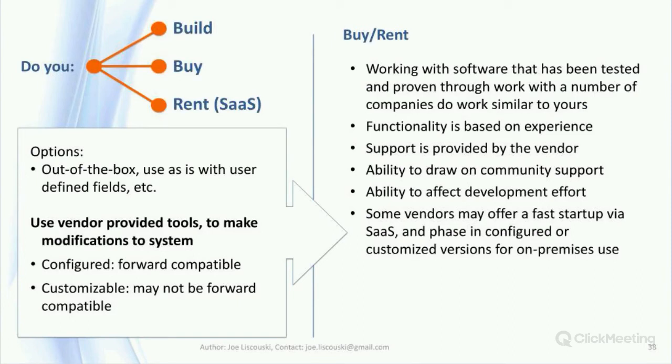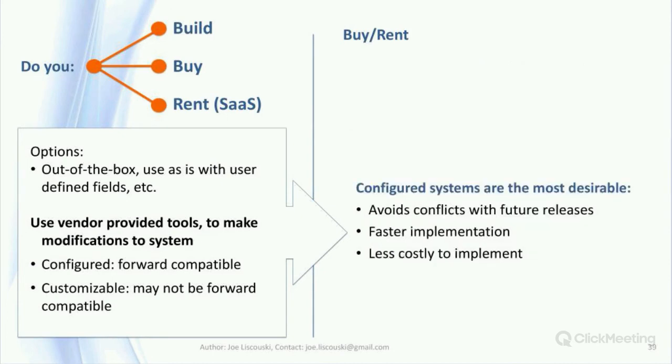How fast you can put the software into practice depends entirely on the preparation you've done in understanding the technology, how it relates to your lab's work, the development of user requirements, and keeping your lab apprised of available products. If you haven't done any of that, you're looking at potentially a year or two's effort. If that work has been done, you should be able to get up and running quickly, particularly if the vendor has a software as a service option that can be moved later on into an on-premise system if that becomes desirable. The biggest issue you're likely to face is the choice between configured and customizable systems as shown on the left.